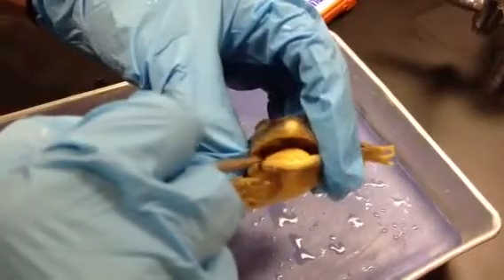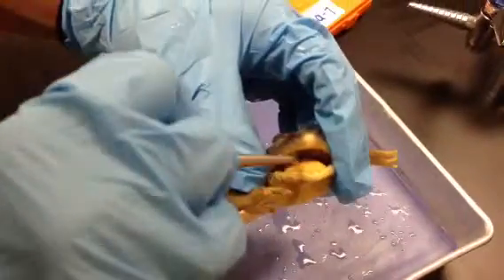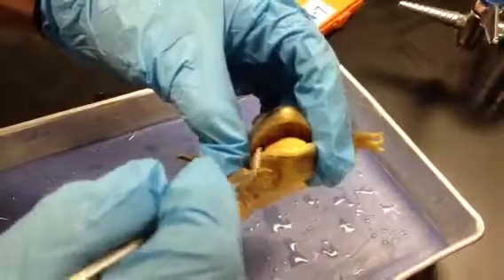The opening to the vocal sac is here. And the internal nares are here.